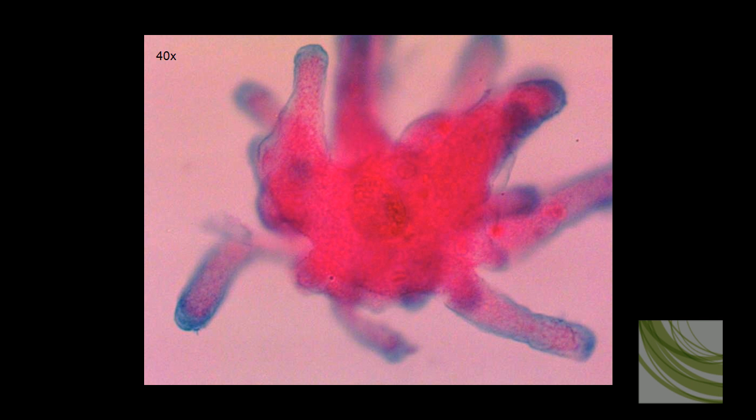This wraps up my discussion of the anatomy of the amoeba. See my other video on the function or life history of the amoeba. Coming soon, I'll have a video with some live film of some live amoeba that we have here at the school.